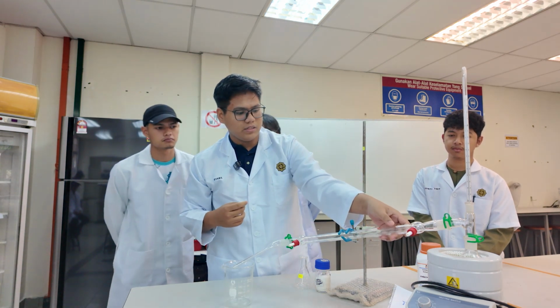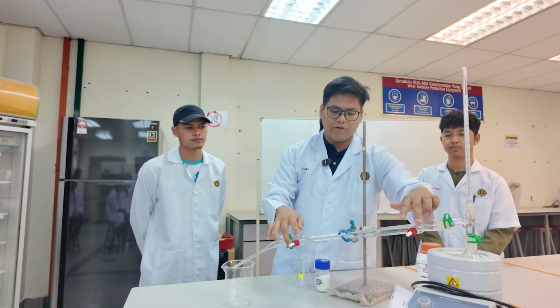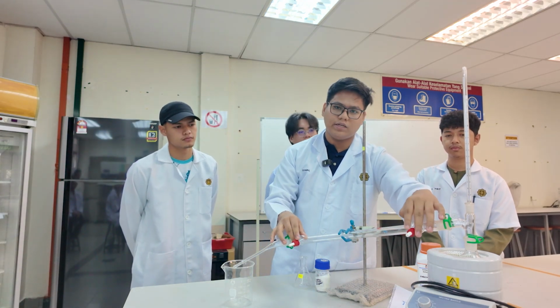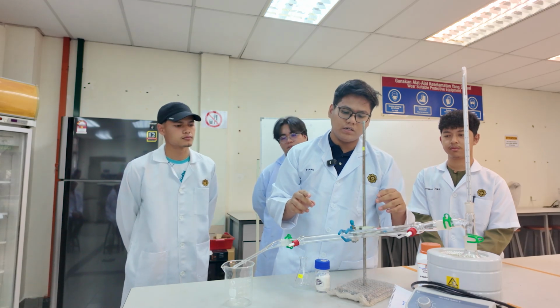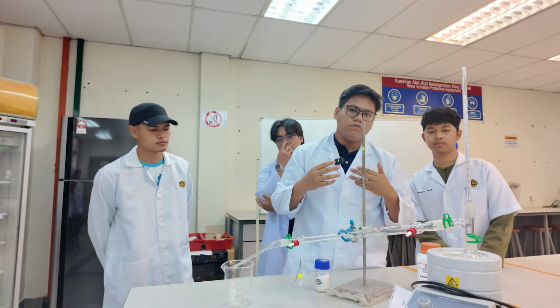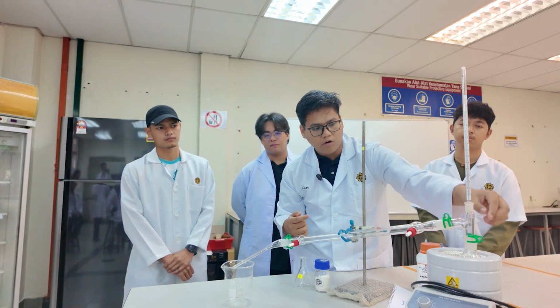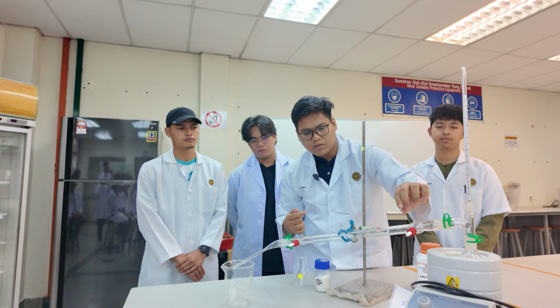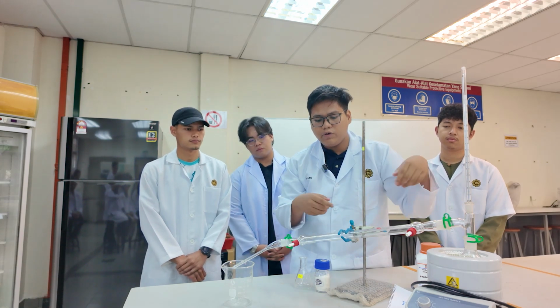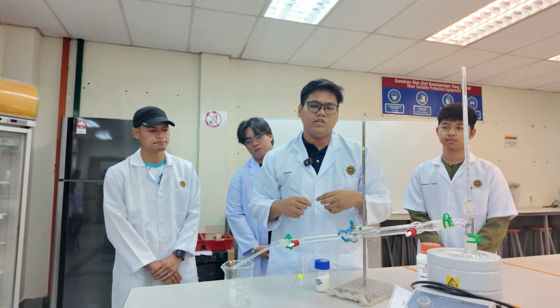So the next apparatus is the condenser. The condenser has two holes. One is the inlet and one is the outlet. We use water in our condenser to reduce the temperature of the vapor that will flow from the round bottom flask to the condenser, and will condense the vapor into the receiving beaker.